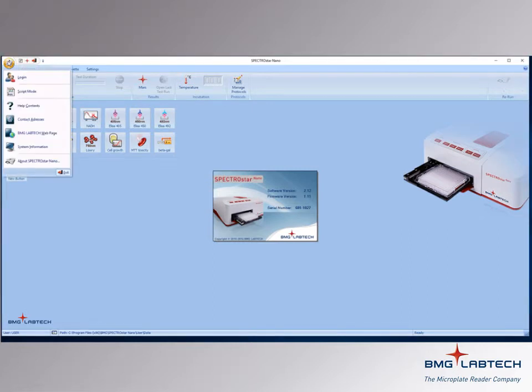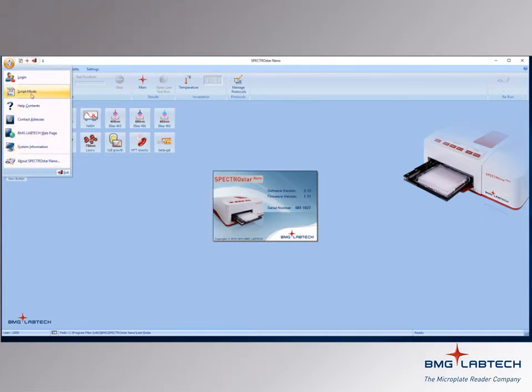Clicking on the reader image opens a drop-down menu where you can change users and primarily find out more about the reader and computer system. In addition, the script mode can be accessed here.